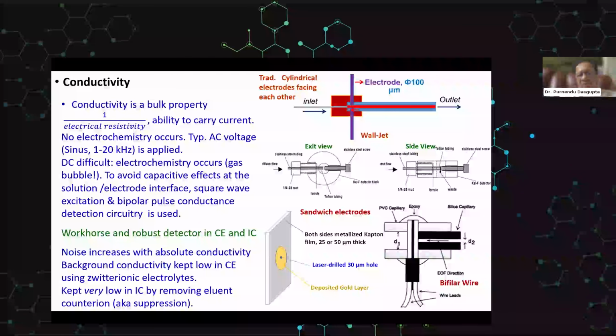But what are the typical geometries? The typical geometry on the macro scale is basically two electrodes facing this way, and the solution flows perpendicularly through it. This is the same thing that is happening here, that you have a tube, except this is a capillary tube, and you inserted these electrodes in here. It's easy for me to say, not so easy to do when that thing is only 25 micron in diameter.